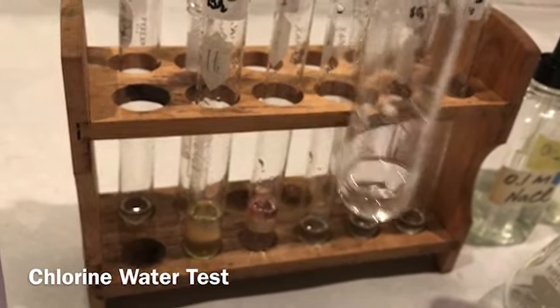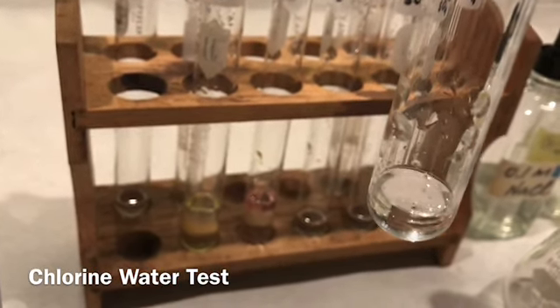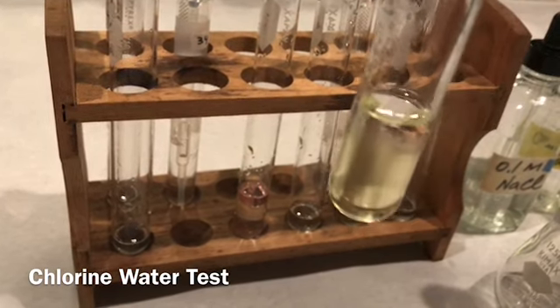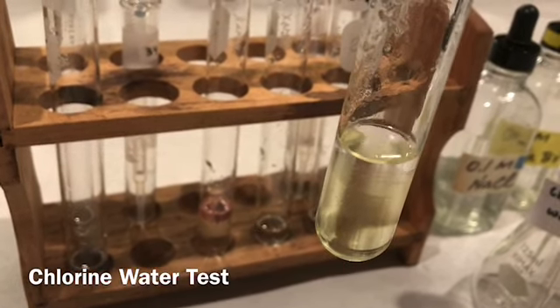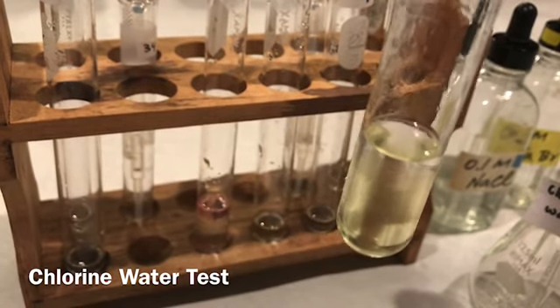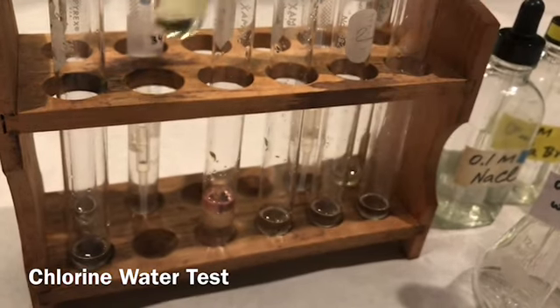You can see the 2 layers in there, but you don't see any color in the upper hexane layer. This is the bromide ion. I can see a slight yellowish color in the upper hexane layer. I did add more of the hexane and the sodium bromide into the test tube in order to show you the clear distinction between the colors.